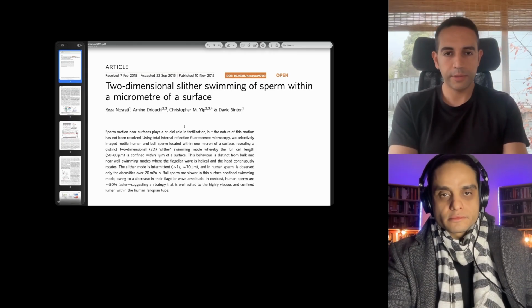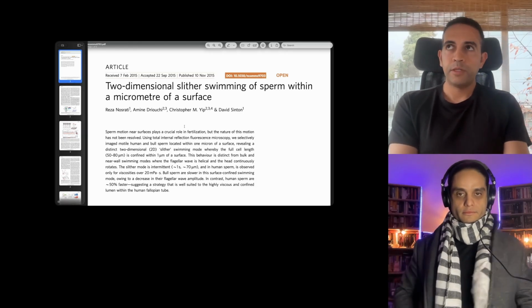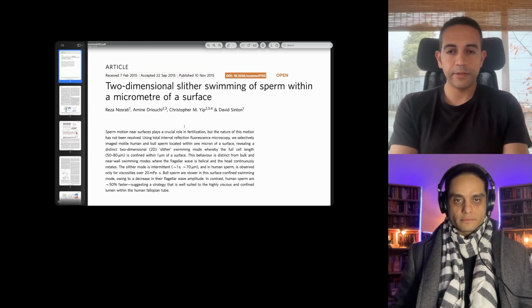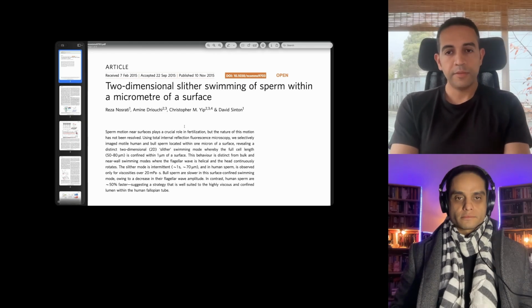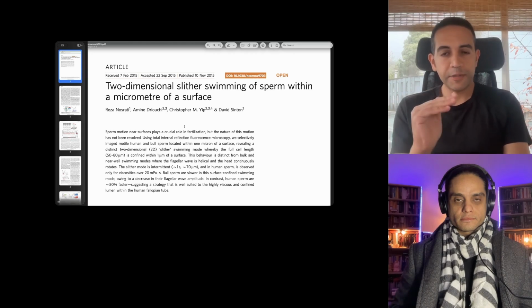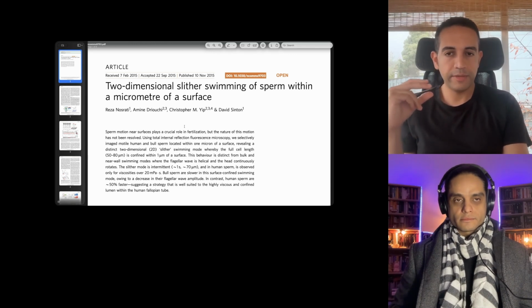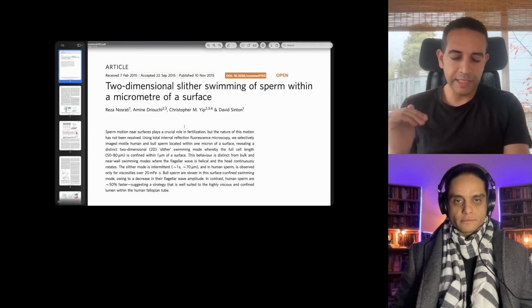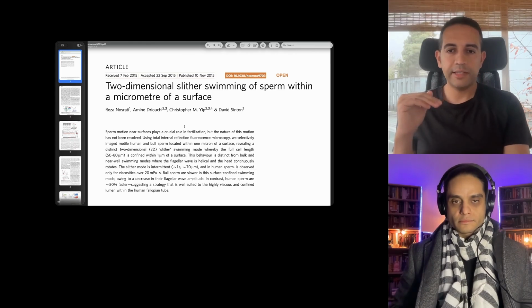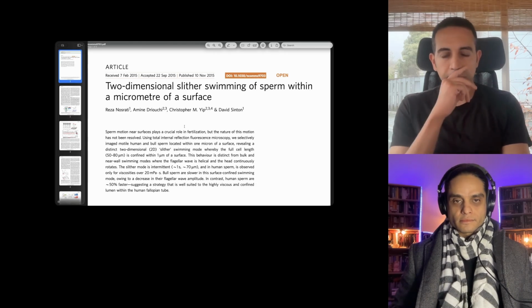And TIRF stands for Total Internal Reflectance Fluorescence. What you're doing essentially is getting your laser, your incident light, to come in through your objective at an angle known as the critical angle, for it to bounce in a manner that's not going to be shining directly at your sample. It's going to create what's known as an evanescent wave. It's a very, very thin wave in theory, if you characterize it the right way. And it decays exponentially, so that if you implement it right, you're only exciting about, I'm going to use a hand-wavy word, I don't know what we put in the paper, let's say 200, 300 nanometers.